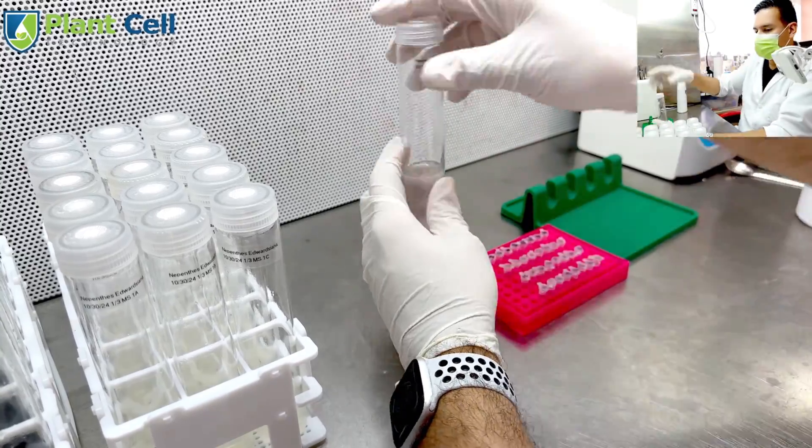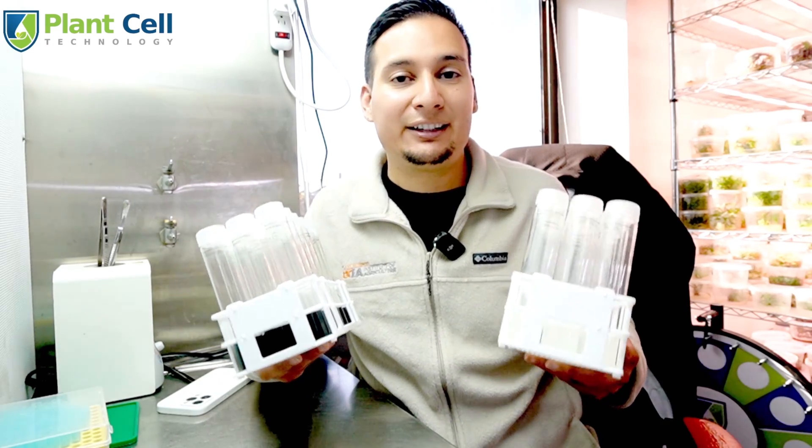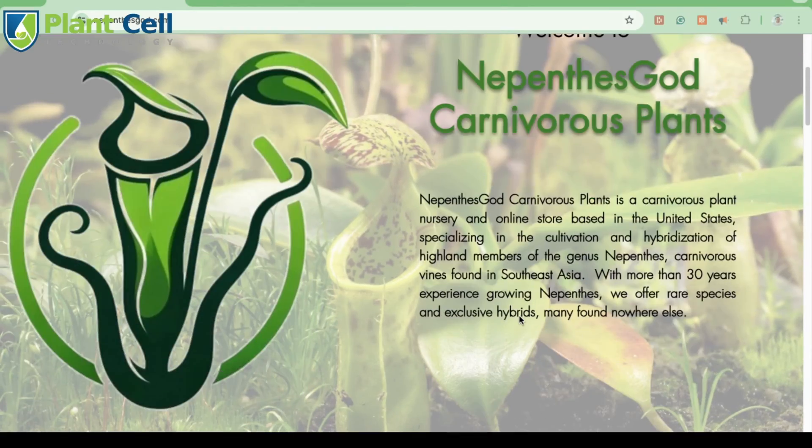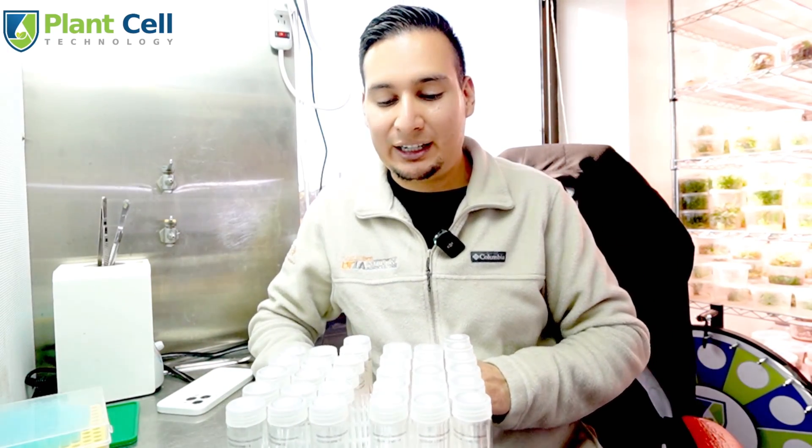Here are my Nepenthes edwardsiana seeds in the test tubes — all I have to do now is wait for them to sprout. Thanks again to Jeff, aka Nepenthes God, for sending me these seeds — make sure to check his website. These seeds can take a while to sprout; according to Jeff's experience, they may take three to four weeks, but based on my own experience with Nepenthes in tissue culture, they can take up to six months.